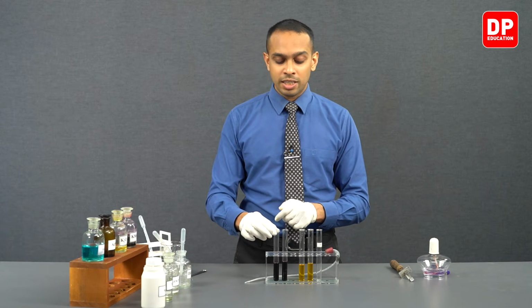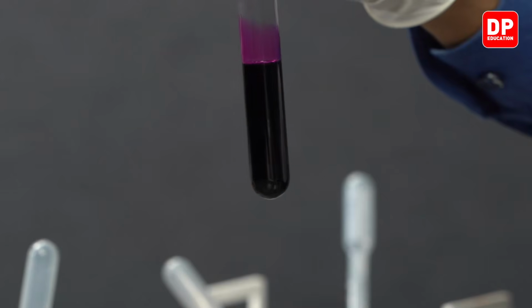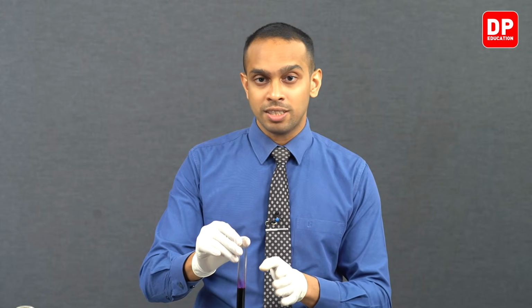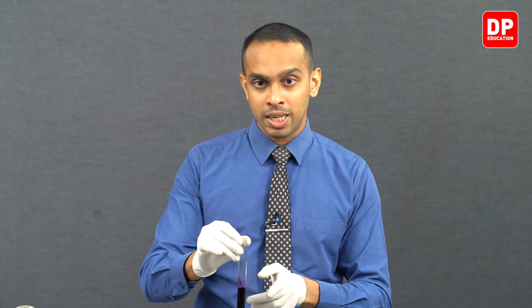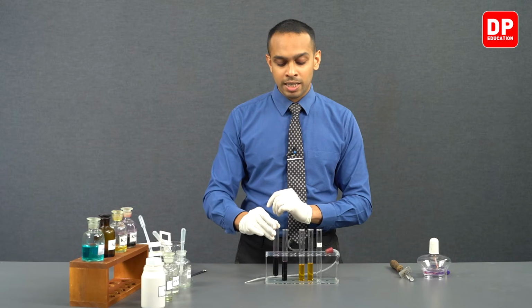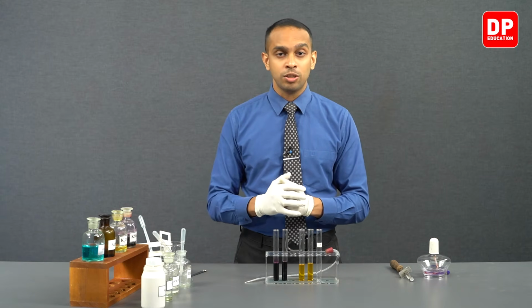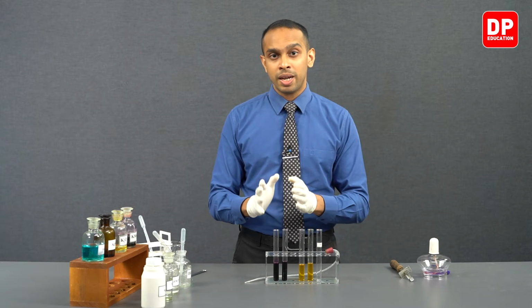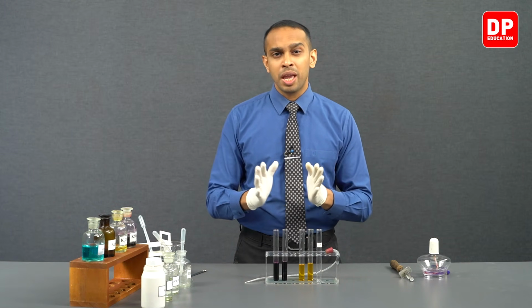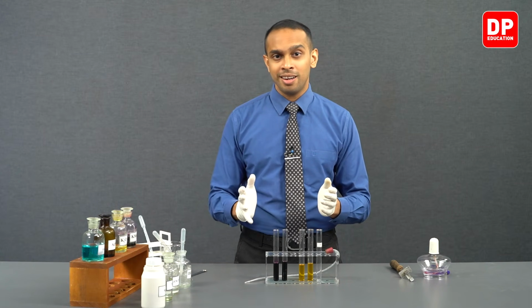Now when we send it through acidified potassium permanganate that we have here, acidified potassium permanganate is purple in color. We have another vial for comparison. So when we send hydrogen sulfide through acidified potassium permanganate, you will see the purple color will disappear. This is because as hydrogen sulfide gets oxidized to form sulfur, potassium permanganate or the purple color permanganate ion gets reduced to form Mn2 plus, which is a colorless solution. So the solution will become clear and colorless.